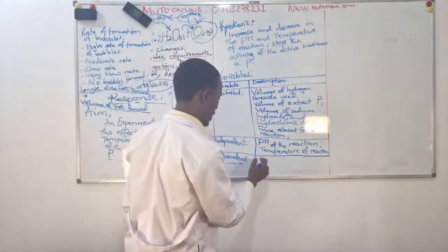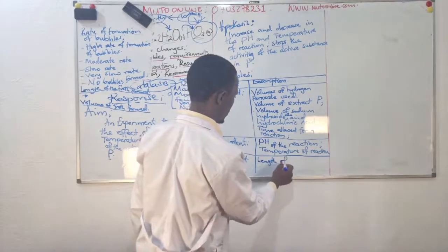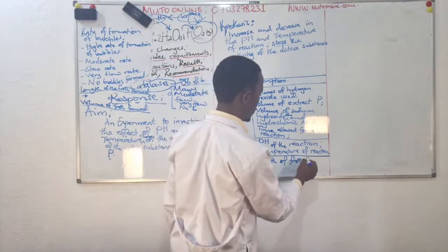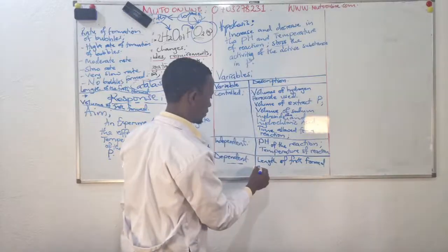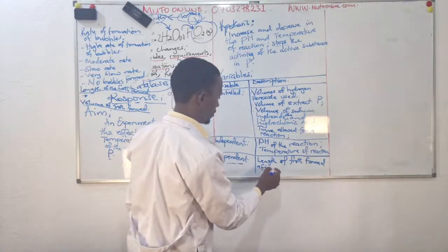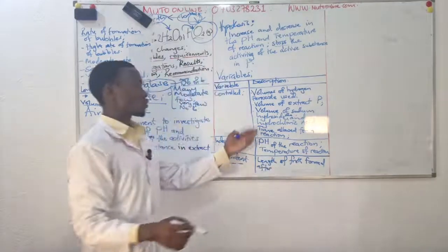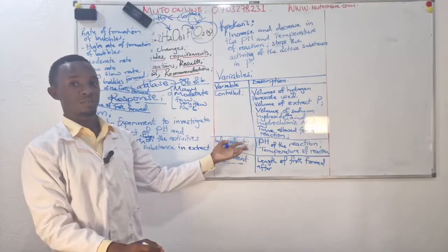I'm going to take the length of froth formed after a given amount of time. I'm going to set a standard time for each investigation.